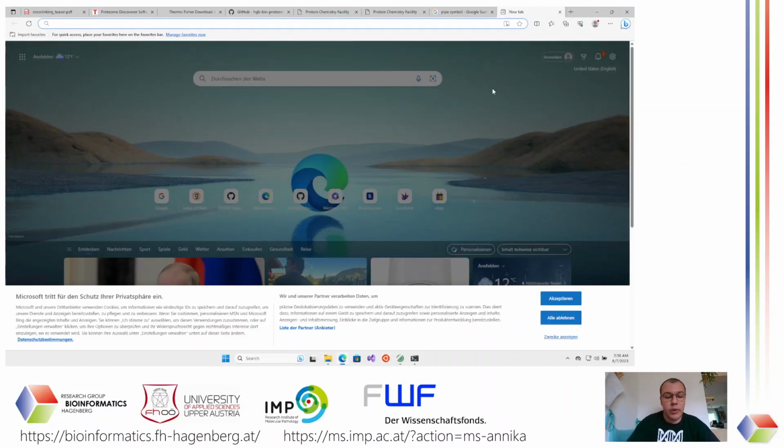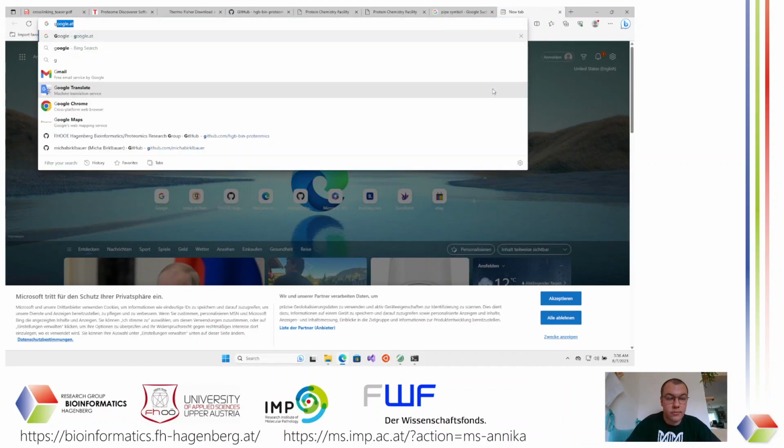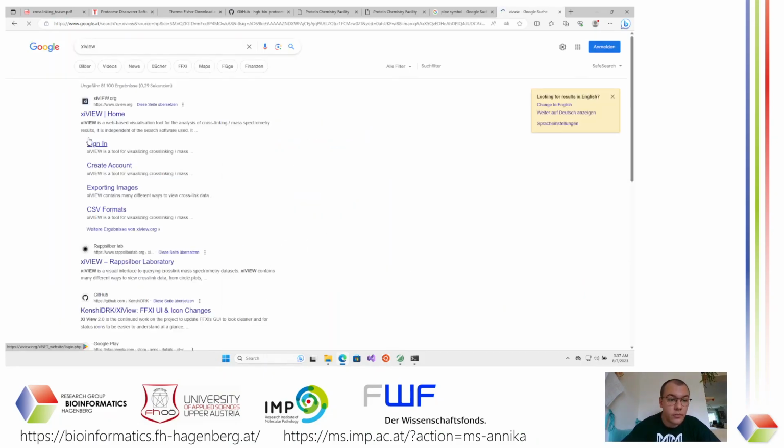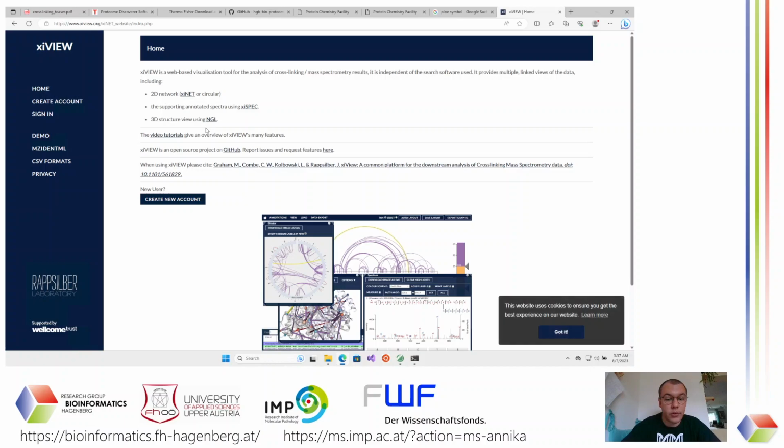So what we're going to do is go over to Google xiVIEW, and you're going to get to this web page. In case you don't have an account already, you create an account. Again, this is for free.